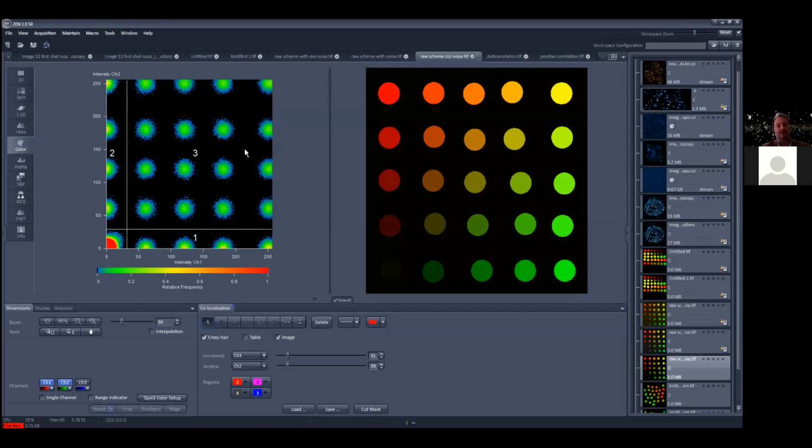And this is now the first, in a very simplistic kind of analysis, one would say that everything here in number 3 is co-localizing. And we will see that there is a little bit of detail to appreciate there. Maybe, are they really co-localizing, or what's the deal here? These objects in quadrant number 3 are both green and red, but they're all over the place. They can be a lot of green and a lot of red and not so green. They can be very green and not so red. They can be both. They're all over the place. Okay, so this is how these quadrants are defined.